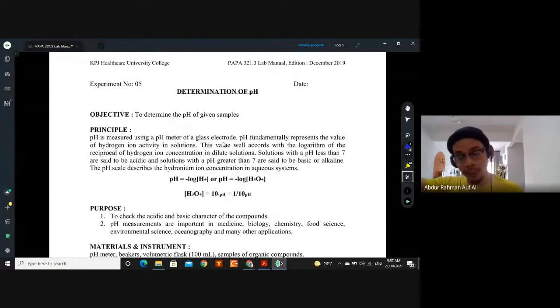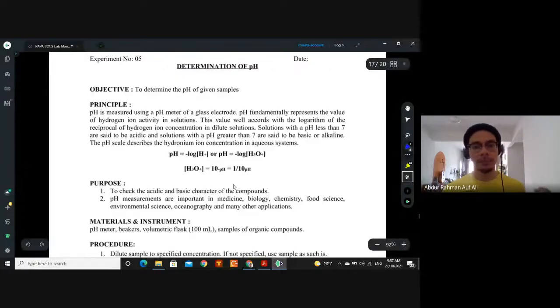Okay, let's say chlorofenylamine maleate earlier, no, better to take a liquid medicine, that's more logical. So let's say salbutamol solution. Okay, salbutamol solution, the API, our body absorbs the API more easily if its pH is 9. Okay, weak base. So we make sure the pH is 9, that's it. So if the salbutamol solution is received in the quality control lab, we take the sample, we put the medicine in a beaker, and then we will use a pH meter.